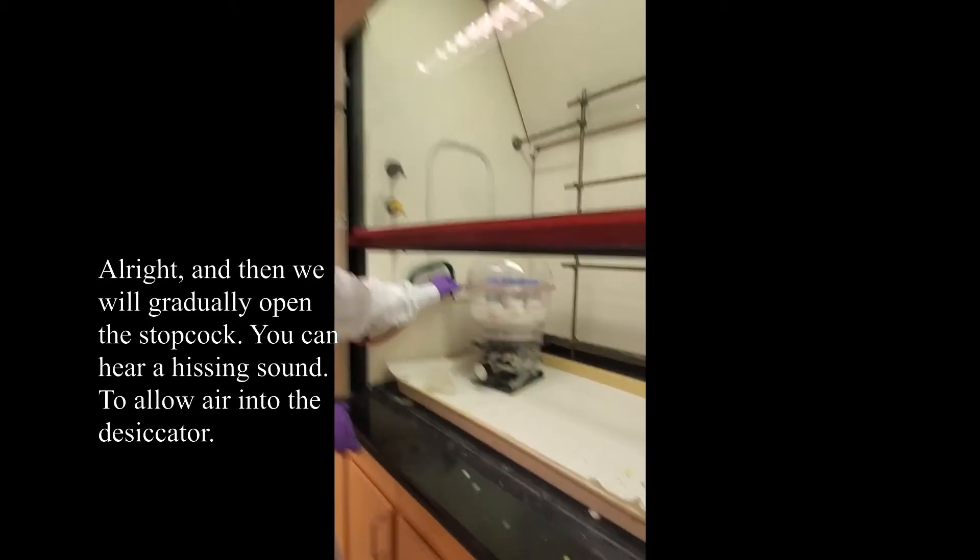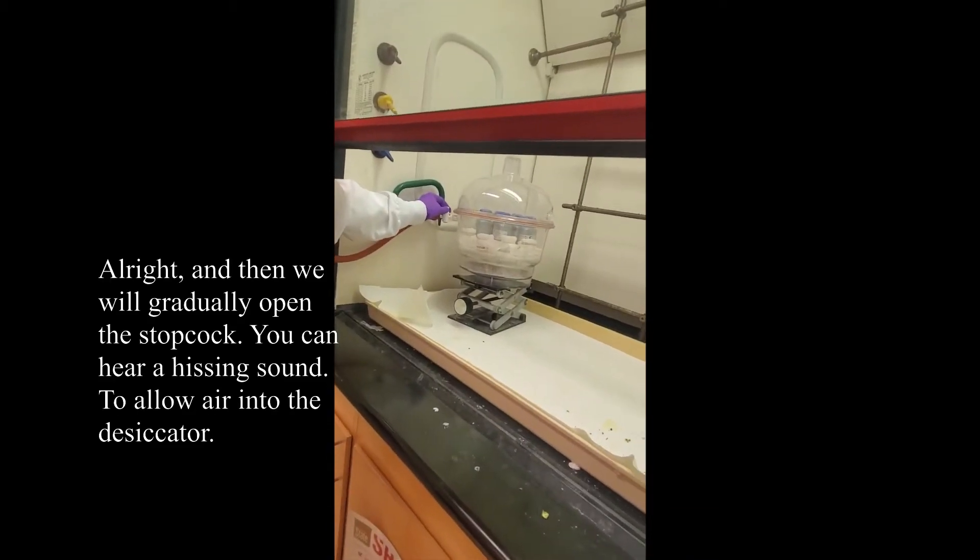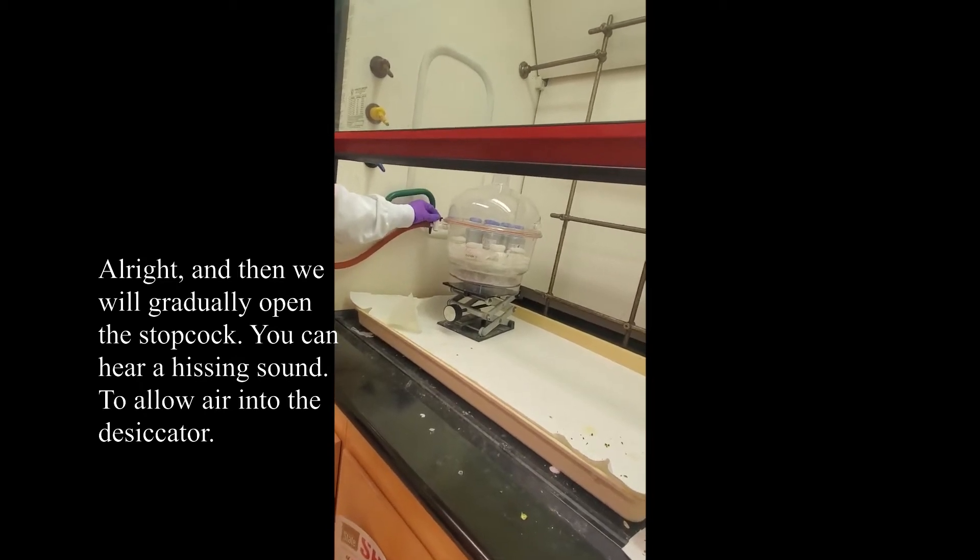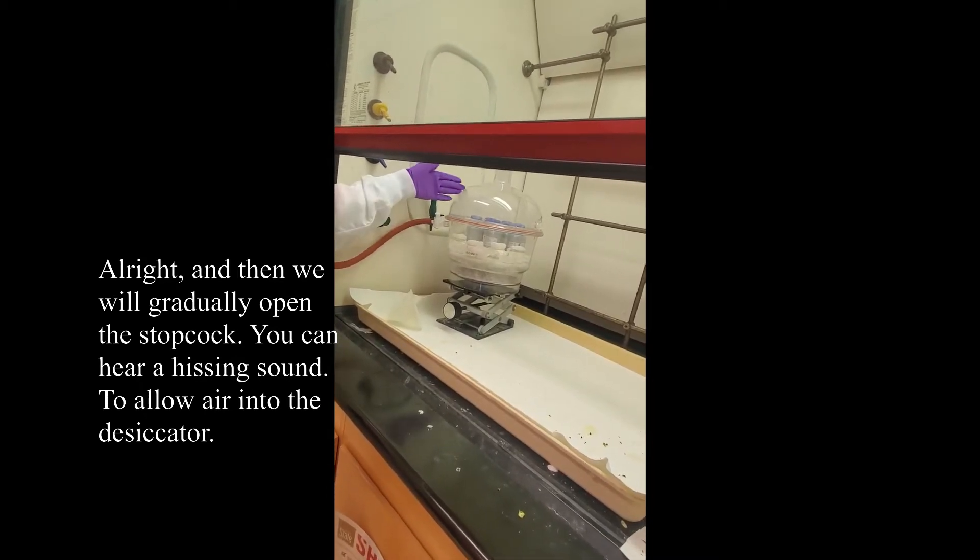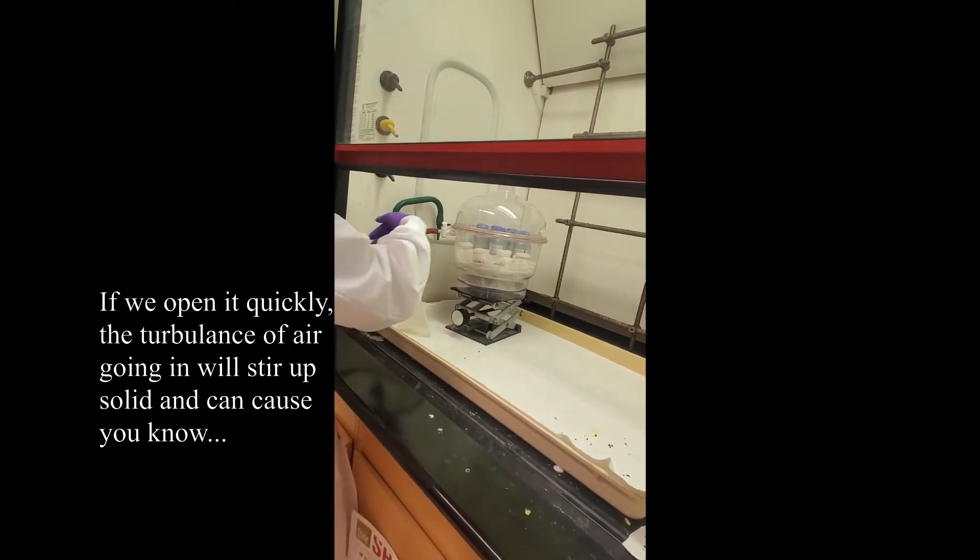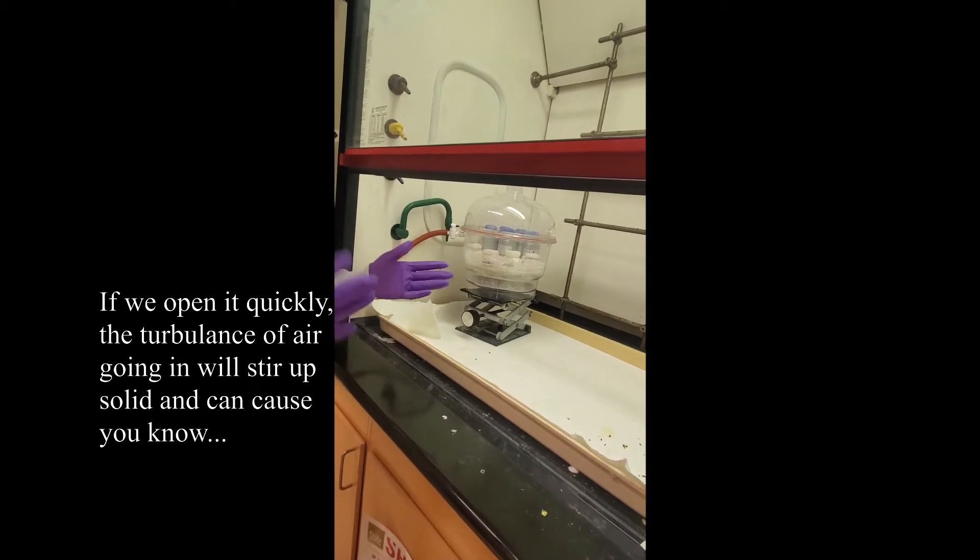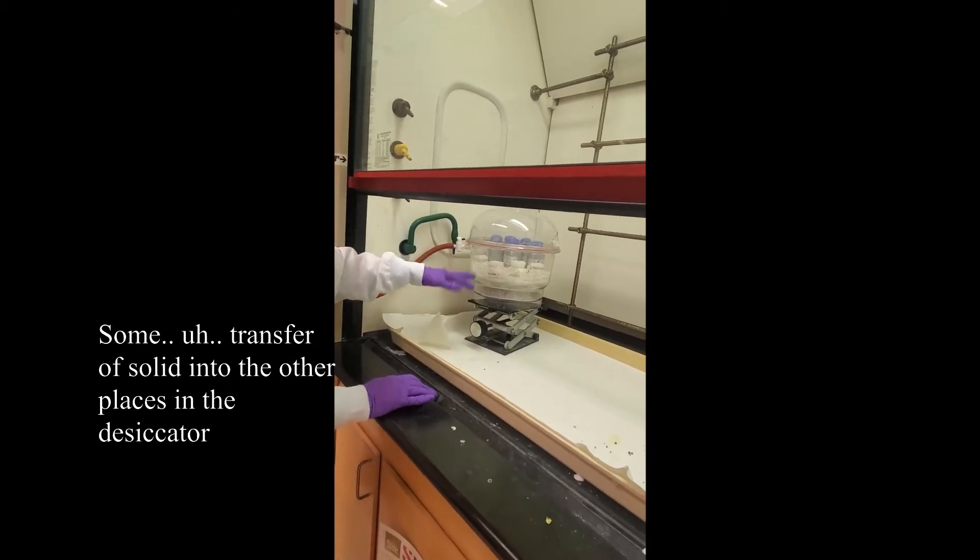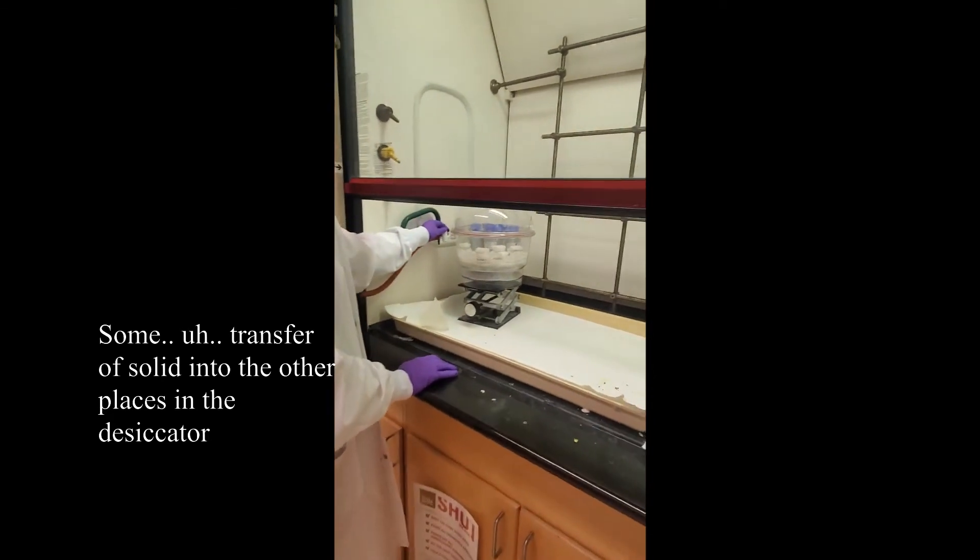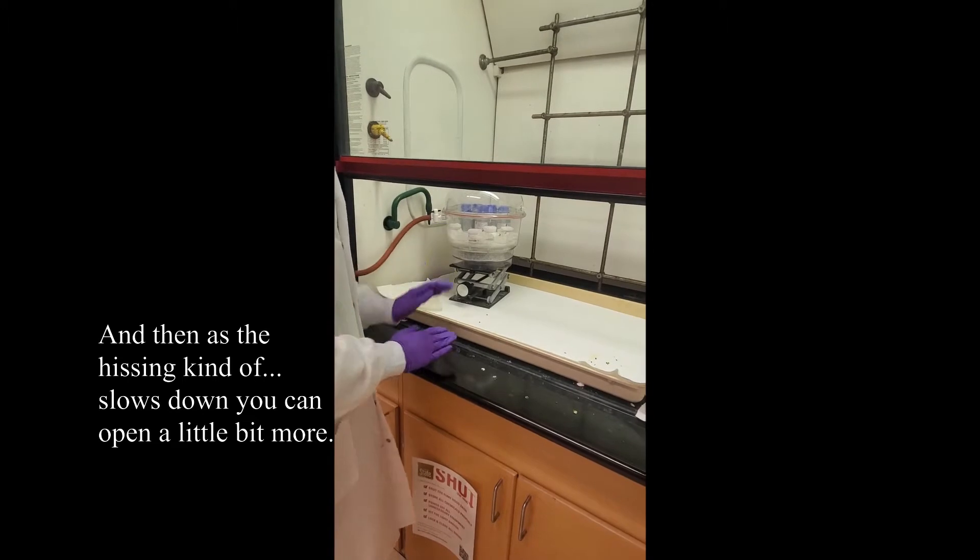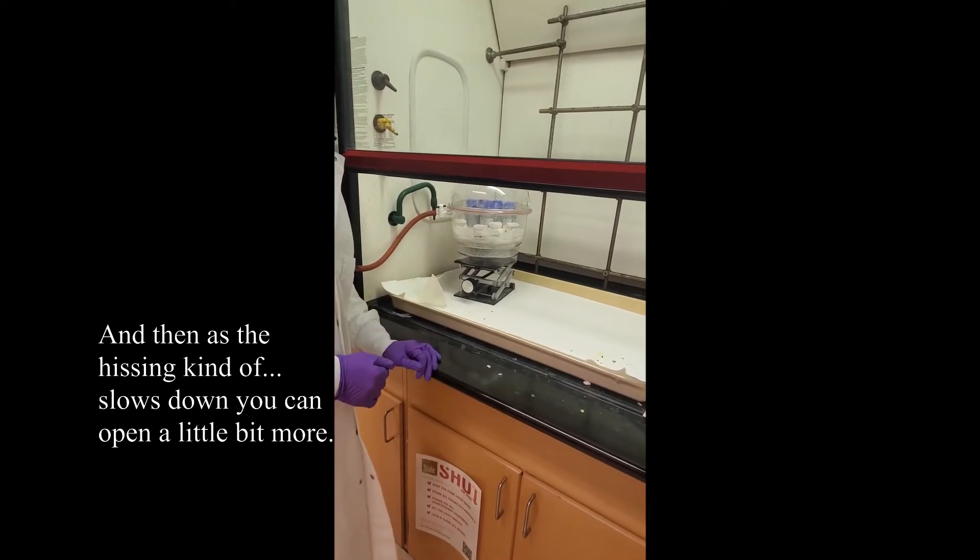And then lastly, we will gradually open the stopcock. You can hear a hissing sound to allow air into the desiccator. If we open it quickly, the turbulence of the air going in will stir up solid and could cause transfer of solid into other places of the desiccator. And then as the hissing kind of slows down, you can open a little bit more.